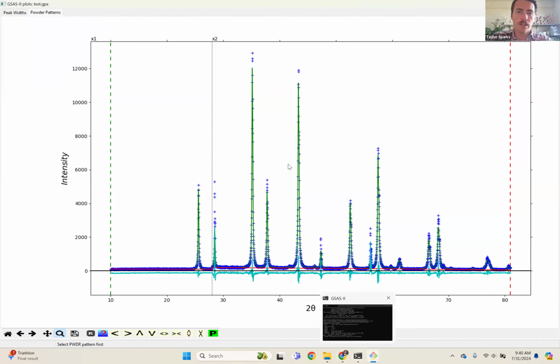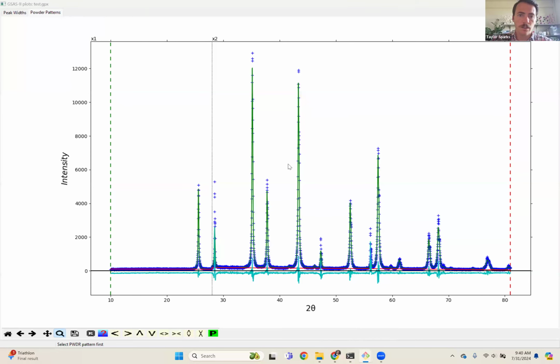Oh, I've not been looking at the chat. Okay, let me go through some of these questions in the chat. So this person said that they couldn't import the raw file. Yeah, so I had to switch when we brought in the file. Instead of using the raw, I had to bring it in as the XY using a comma separated value.